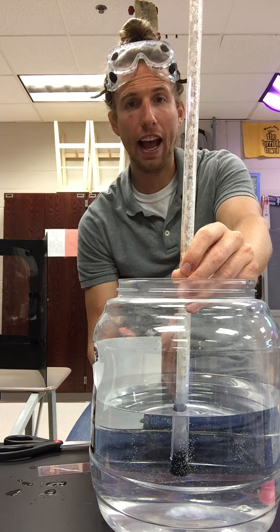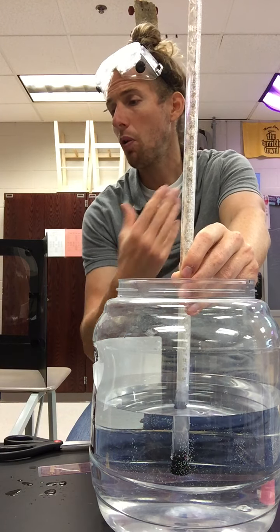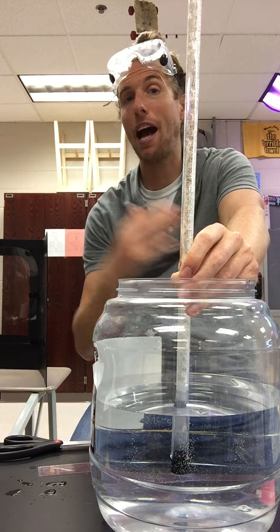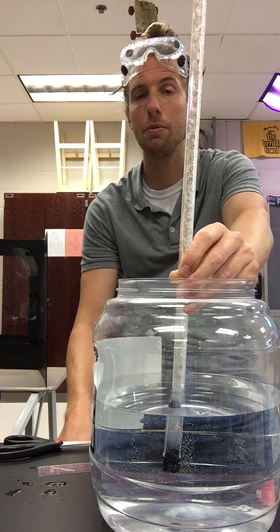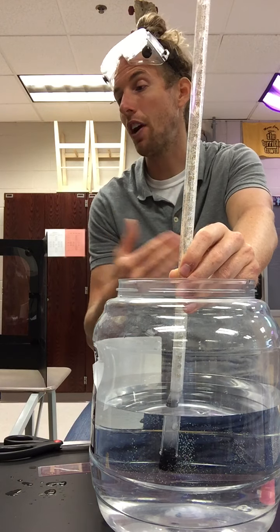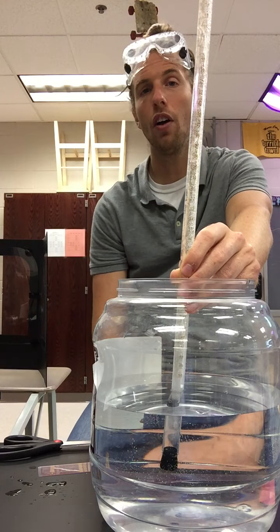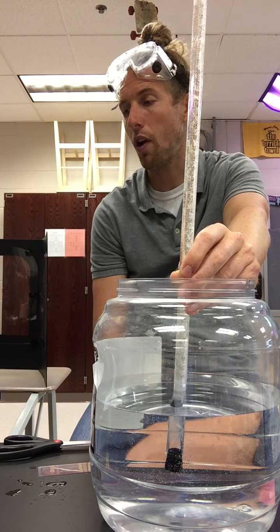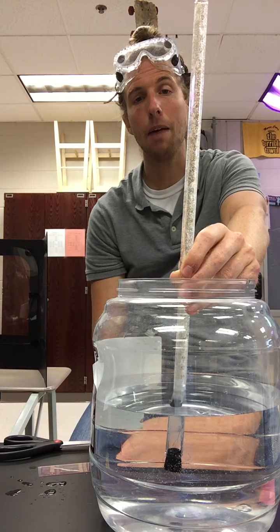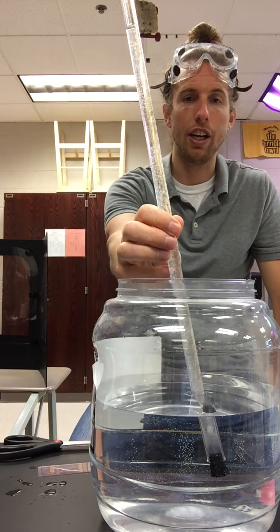You can start looking ahead to the questions and the calculations that come up in this lab. When we calculate, one of the things we're going to have to do is figure out the mass of our magnesium ribbon. I gave you the mass of an entire meter, 2.04 grams. We're only using a small part of that. We're using 1.41 centimeters, so you can figure out the mass of that ribbon. You can convert that to moles, right? All this stuff we know how to do. There's quite a bit that has to go on in the calculations part of this lab, and you can get cracking on that now if you'd like, while this reaction continues to happen.